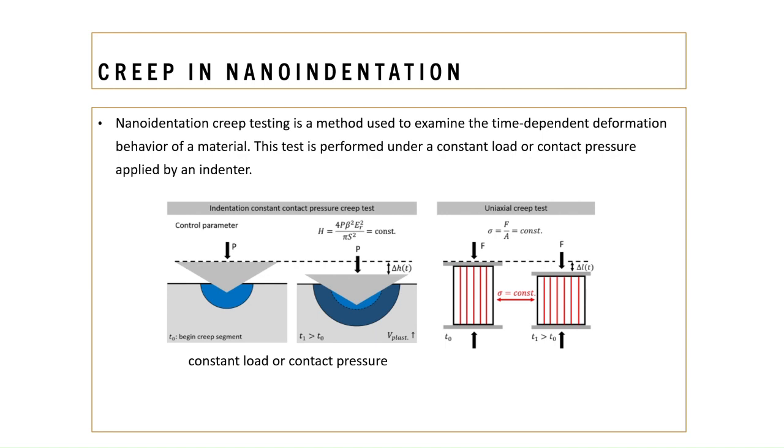The deformation rate and stress-strain relationship are analyzed to evaluate the creep behavior of the material. Creep tests are used in various fields such as fatigue and durability assessment. These tests help predict how a material will behave and perform under real-life operating conditions.